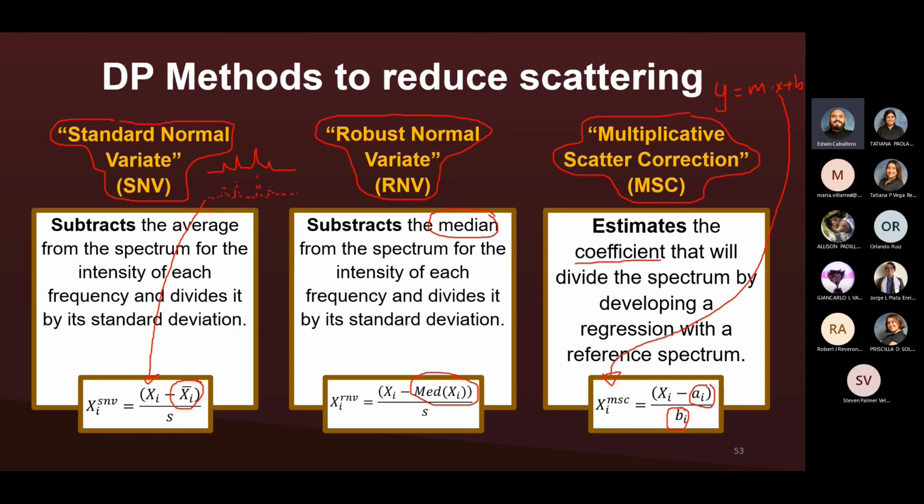The extended version allows you to add a good spectra and a bad spectra, so it can even calculate the coefficients better than before. However, you need to manually insert them. It's a lot less reproducible than SNV, hence I prefer to use SNV. However, I do use MSC a lot when I do my models, but usually SNV takes the cake.